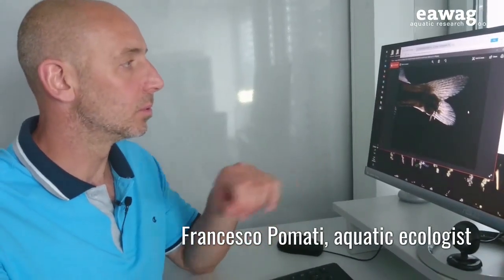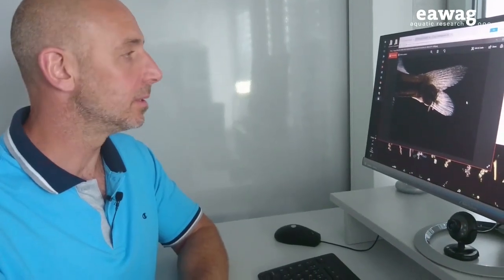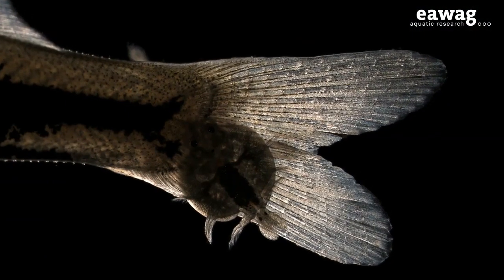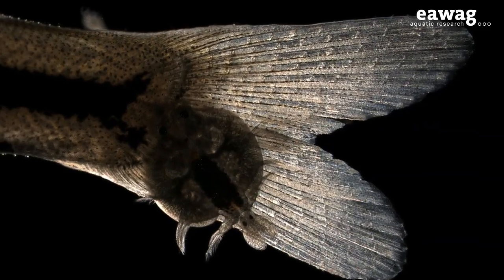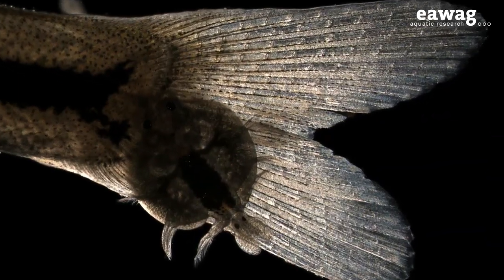Accidentally, sometimes, we also image some fish, and in this case we have a beautiful parasite attached to the tail of this very small fish.